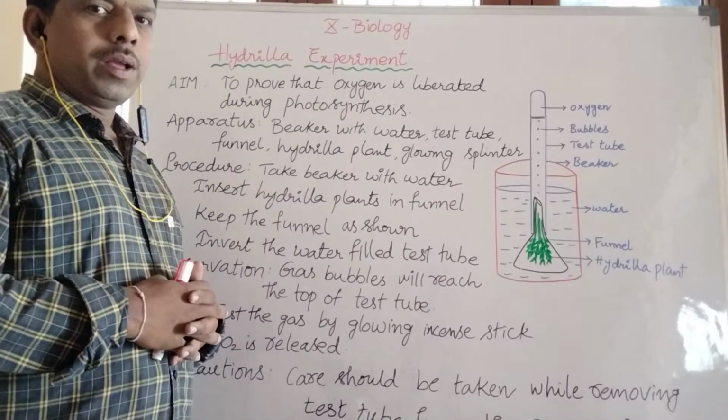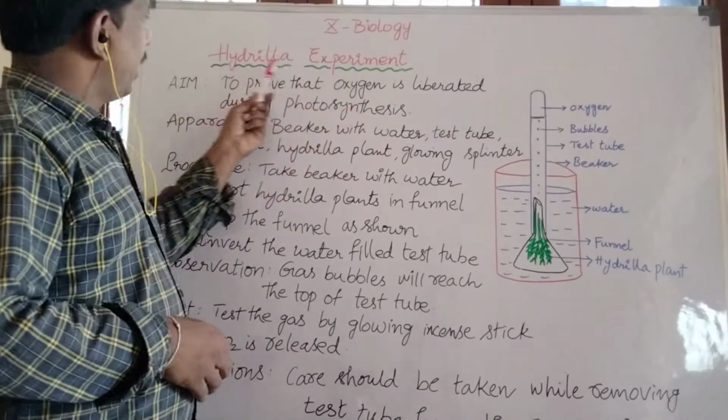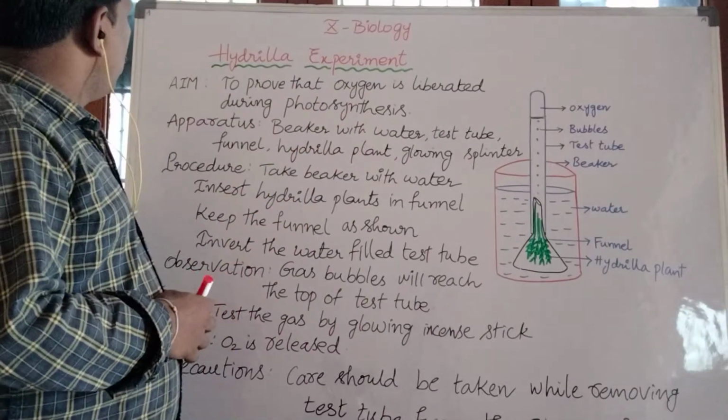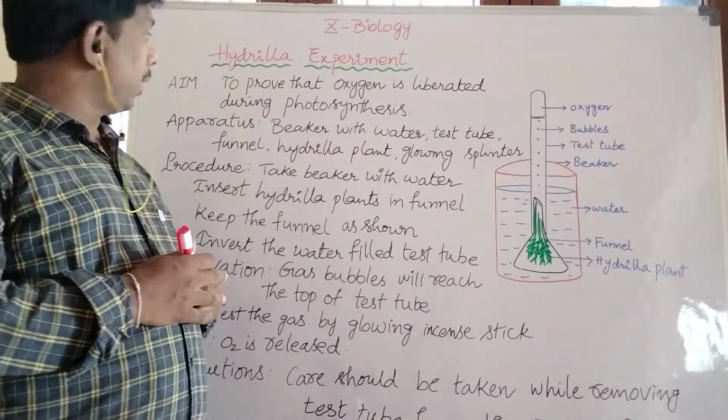Sudhakar. Today I want to talk about the topical 10th class biology Hydrilla experiment. What is the Hydrilla experiment? How will this experiment be conducted?